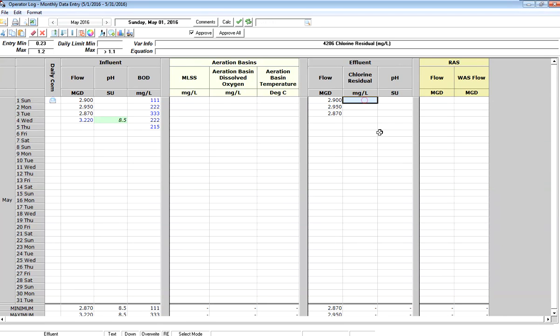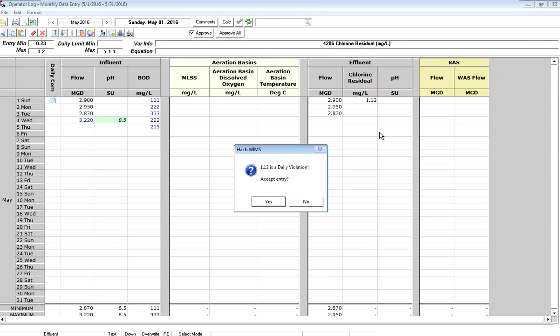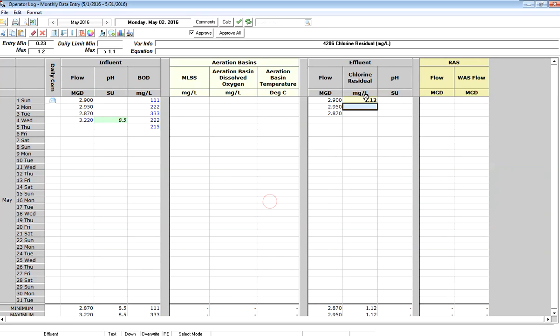I'm going to go to chlorine residual now and I'm going to enter in a value of 1.12. What it tells me there is that it is a daily violation, because we've set up our regulatory limit of 1.1. So we're in violation if we're greater than 1.1. If I say yes to accept it, it puts it in and shades it in this light yellow color.